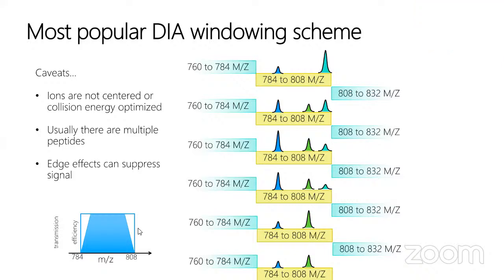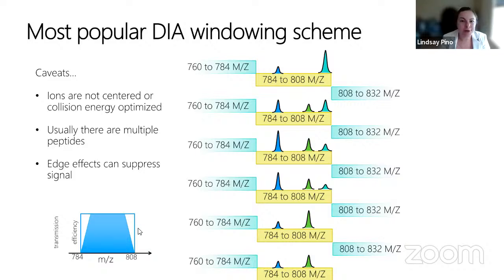One thing we should point out is the forbidden zones are really for charge 1, 2, and 3. If you go up to higher charge states, they don't work as well. And there are caveats too. If you're doing something like phosphoproteomics, phosphorus makes a very different forbidden zone profile than the regular carbon, nitrogen, and oxygen. Very in the weeds answer, but I'll throw references in that document link on the May Institute website so that you can have them after this Zoom gets shut down.